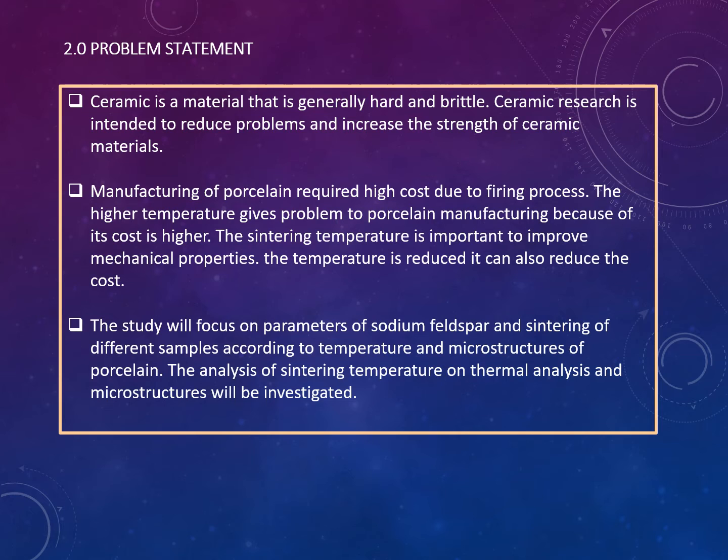The study will focus on parameters of sodium feldspar and sintering of different samples according to temperature and microstructure of porcelain. The analysis of sintering temperature on thermal analysis and microstructure will be investigated.